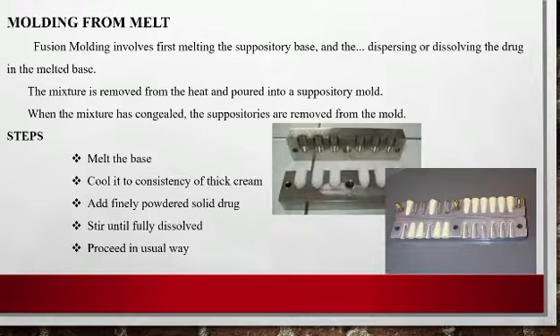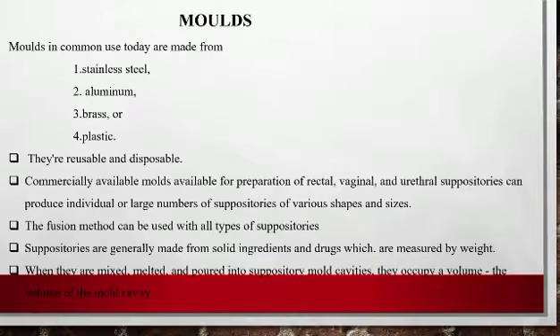First, the steps. We melt the base and cool it into a consistently thick cream, and we add the solid drug and stir until it is fully dissolved, and proceed in the usual way. After that we congeal the mixture. After it gets congealed, the suppositories are removed from the mold.